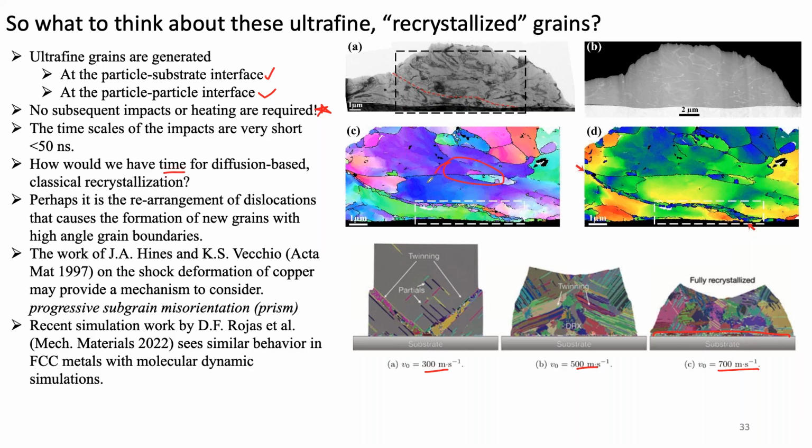Another follow-up question to the sample prep: are those cold mounts or hot mounts? We typically use hot mounts for the coatings, and we use cold mounts for the individual powder particles because it's a different kind of epoxy.